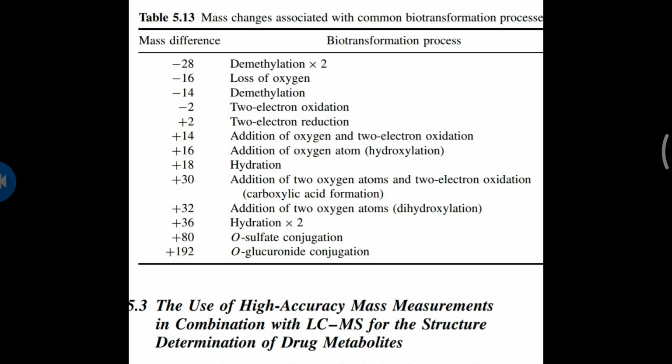In this, we discussed two types of interfaces applied in the structural study of five types of fungicides. And next we also discussed target compound analysis using LCMS MS for identification of drug metabolites.